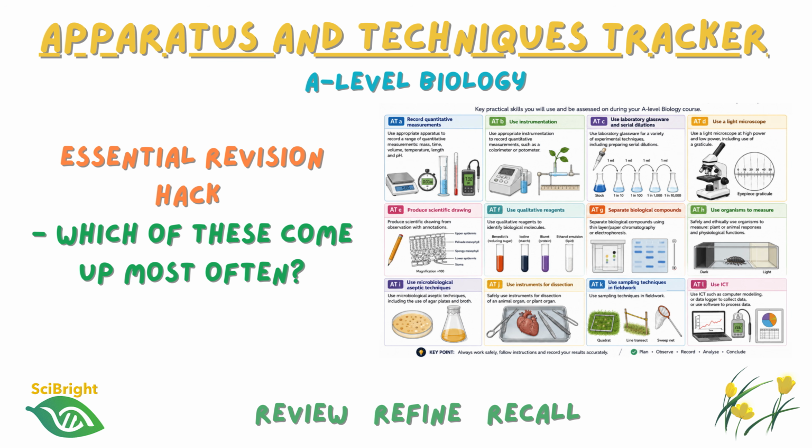There's certain knowledge and skills more likely to be assessed in A-level biology than others. So whether you're about to sit your exams or just starting your A-level biology journey, it is essential you are familiar with the apparatus and techniques checklist that all exam boards use to ensure students are familiar with common instrumentation, apparatus and skills relevant to the course. First, we will go through the list.